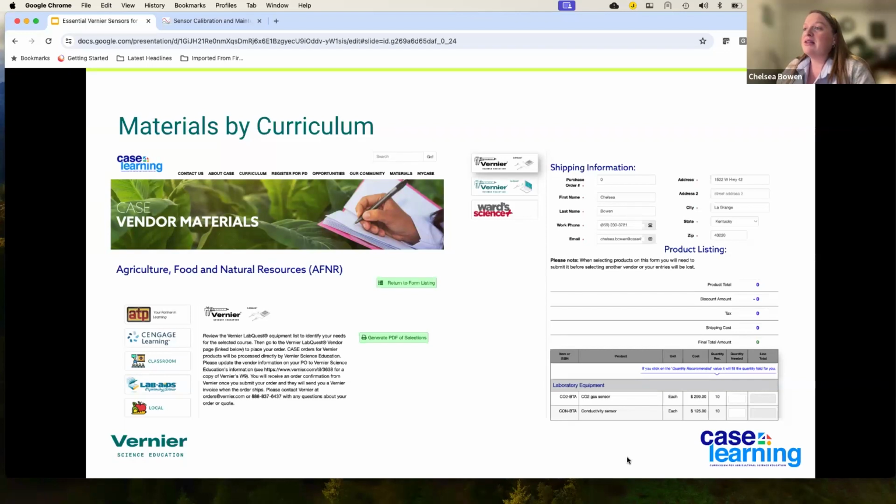If you're going to go the traditional route, if you're looking at a curriculum that has a lot of the plug-in sensors, then you might need to invest in LabQuest so that you can support those sensors. So the Vernier LabQuest are going to be in black and white, and the Vernier GoDirect is going to be the logo that is in green and white. And it has a little bit of imagery there to kind of help everybody understand where to go.